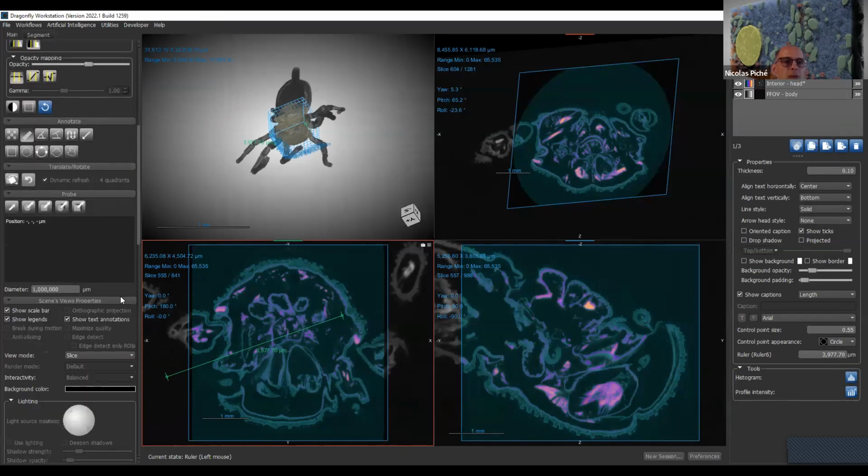We can do the same type of analysis, but with a probe. A probe is where you click somewhere in space and you want to know the value of the tone of gray. It could also be with the region of interest: what is the value of the region of interest, what is the label of a multi-label region of interest? So I can do a point. And you see here the position in real space, the voxel coordinate, and the value of each of the 2 data sets and their corresponding position in voxel coordinates, because they don't have the same density and the same position.